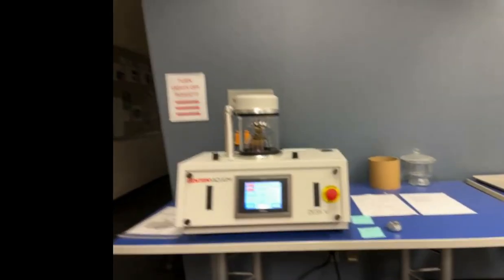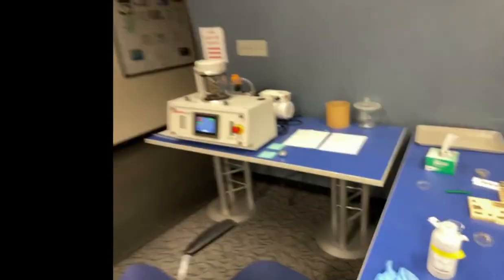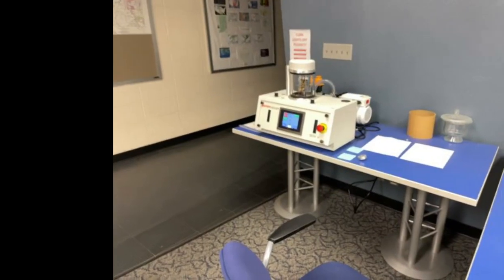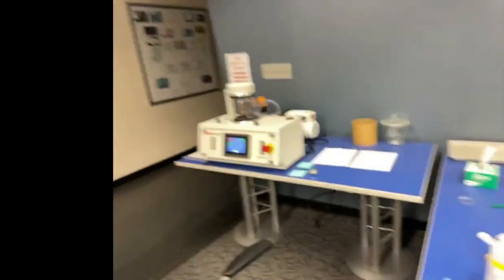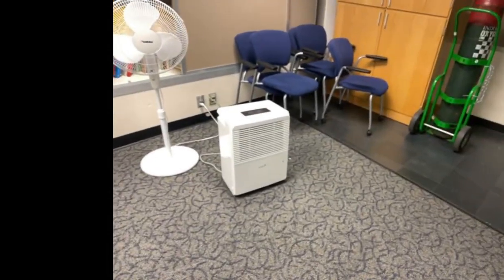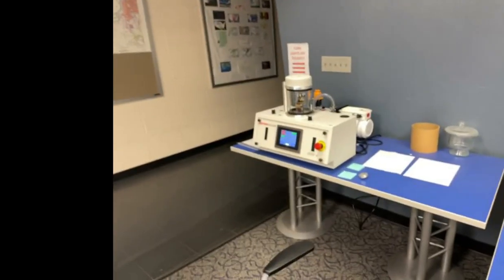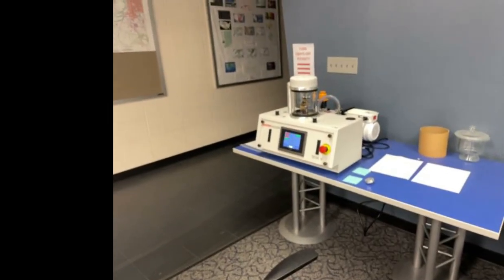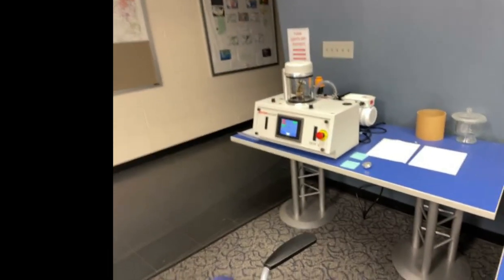And usually I wait till this thing says 1.2 or so. It's taking its time getting there. One of the things is that when the air has a little bit more moisture in it, it takes a little bit longer for the vacuum to pump down, to get the moisture out of the chamber. Normally we have this dehumidifier running in the summertime when it starts to get humid. But I don't think we've pulled out the water, so I think it's full. I'm going to do that while we're waiting for the sputter coating to happen, or maybe once we get the samples in the chamber. And the relative humidity in our room is up to 70%, which is quite high.